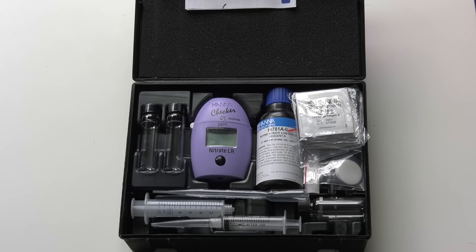Here's a look at what's inside the Hanna Low Range Nitrate Checker Kit. I'm going to use most of the items while I'm getting readings, so I won't run you through each one individually.